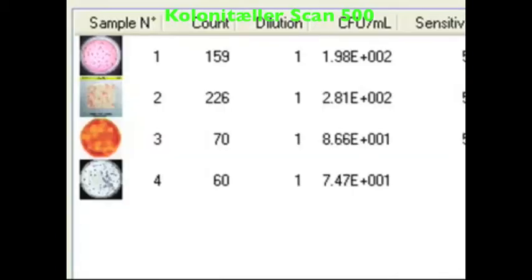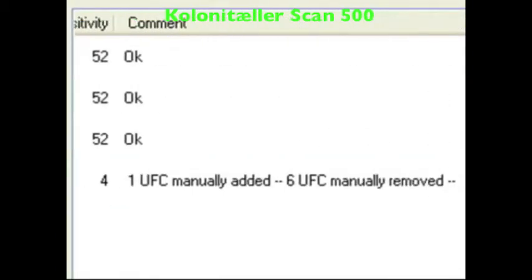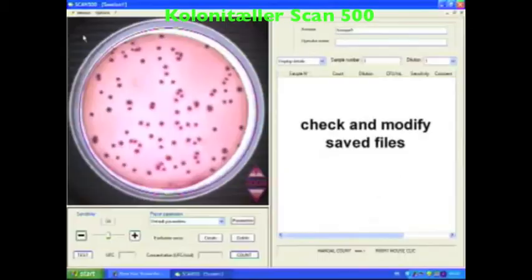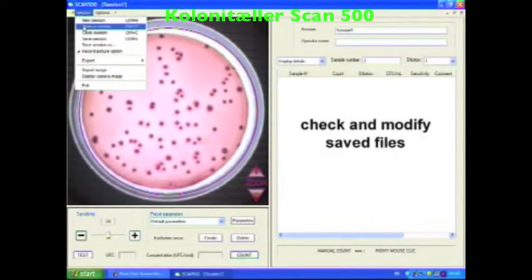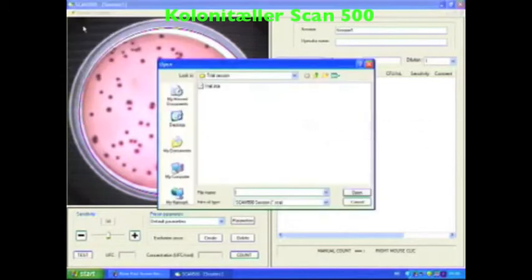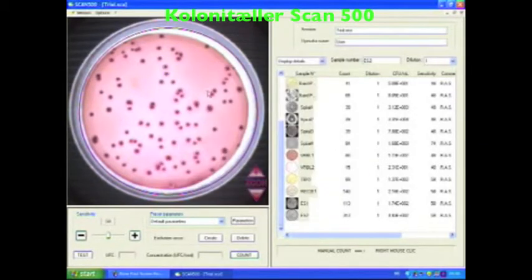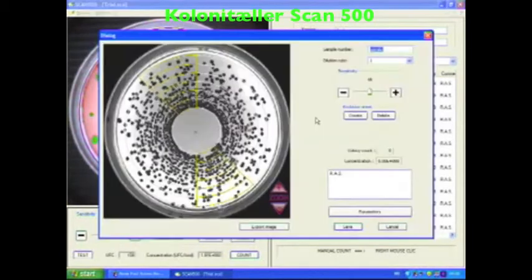The description of all your operations appears in the comments area. All your petri dish pictures and data can be saved. You can check, recount and modify your data at any time and export to Excel.